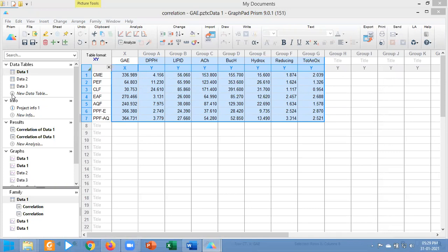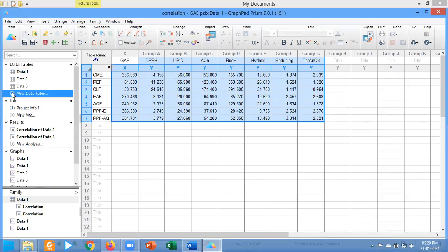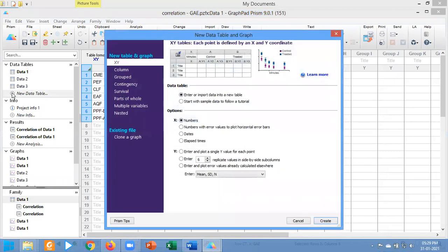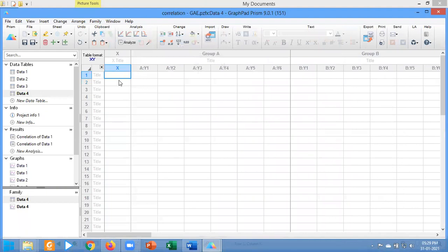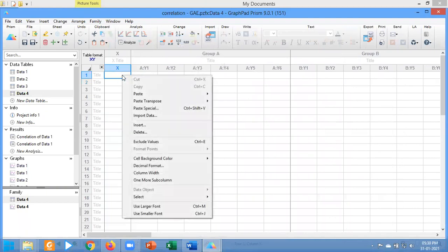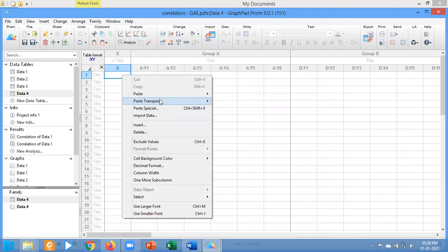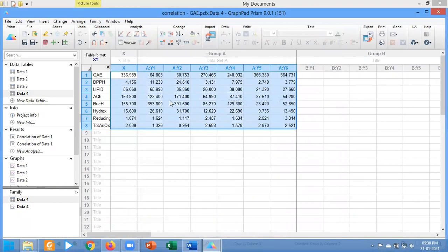Therefore you have to copy this data, click on new, and I will need six columns. Create six columns and right-click, choose paste transpose, select paste data. You can also use Ctrl+Shift+T, and my data has been transferred from the column to the row.